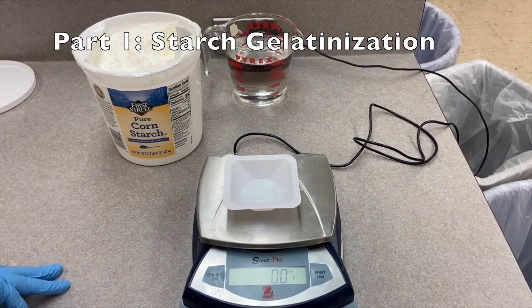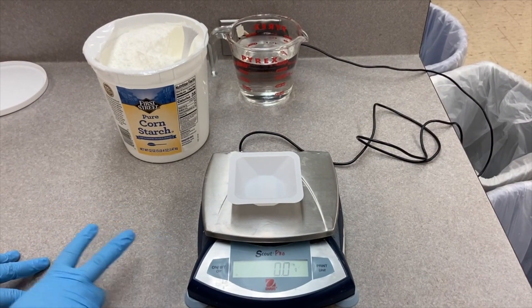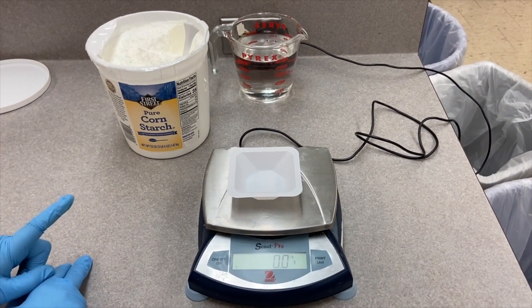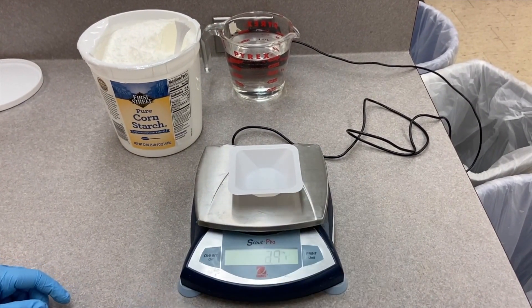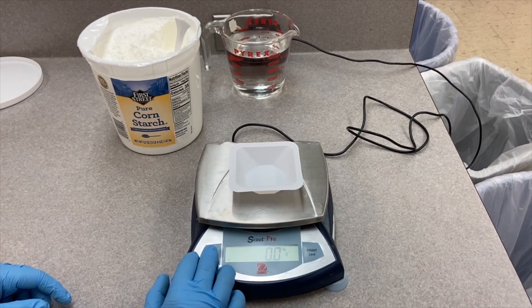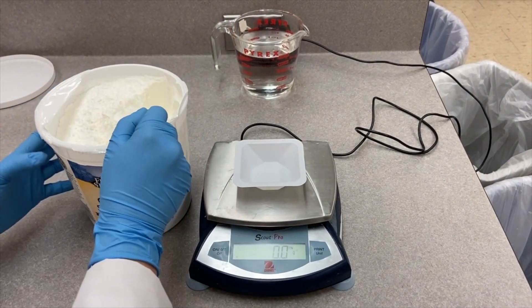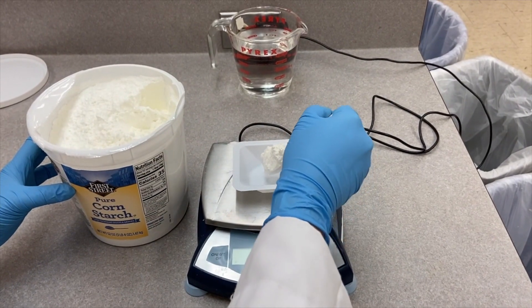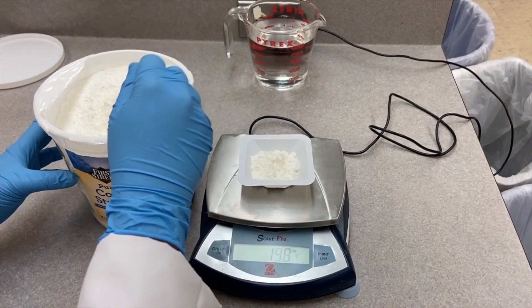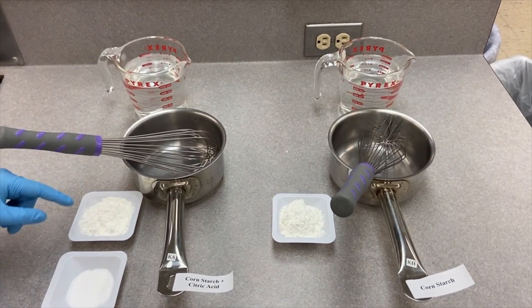We're going to start with the first part of the experiment: starch gelatinization. First we will obtain two 36-gram samples of cornstarch and one sample of 16 grams of citric acid. We place the weighing boat and tare it, then place 36 grams of cornstarch. Now we have two samples of cornstarch — one without and one with 16 grams of citric acid.